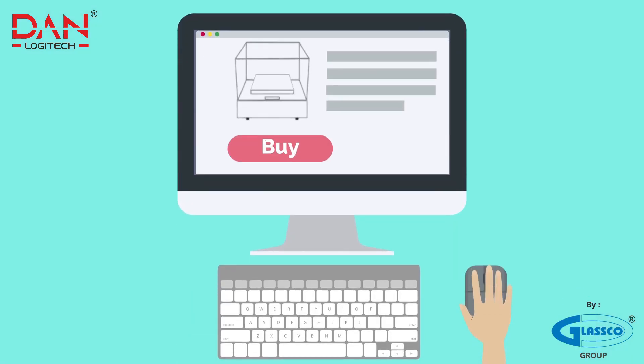Purchase Dan Logitech's incubator shaker with cooling today. It's just a click away.